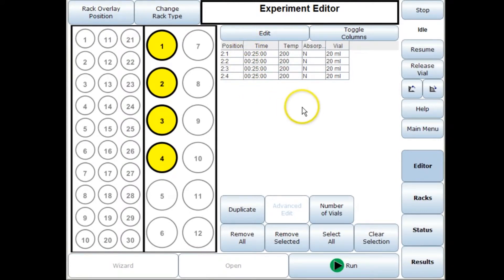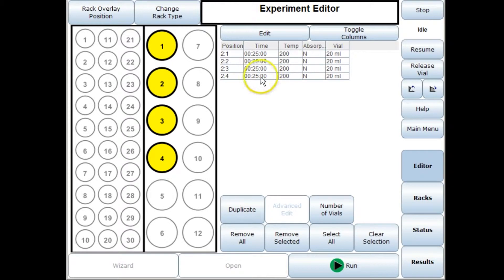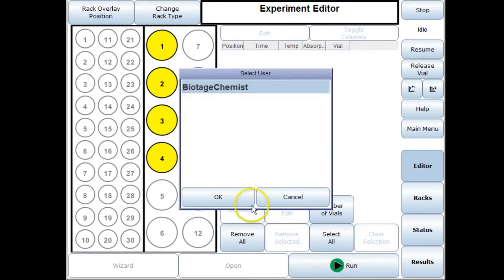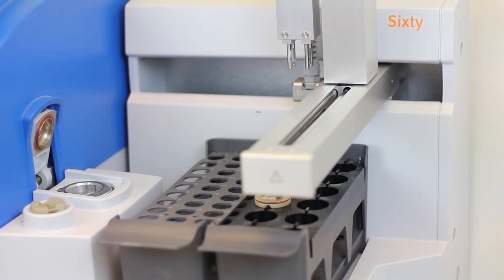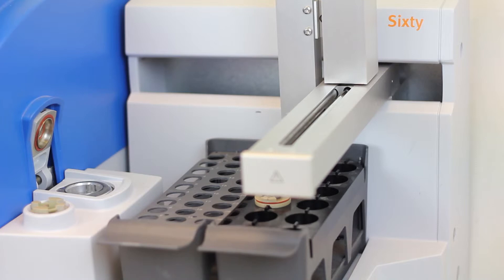Now if you've got a reaction where everything's in solution that means you can make up your reaction mixture in one pot and then you can just transfer that to each of the different vials and then all you need to do is press run and you're good to go.